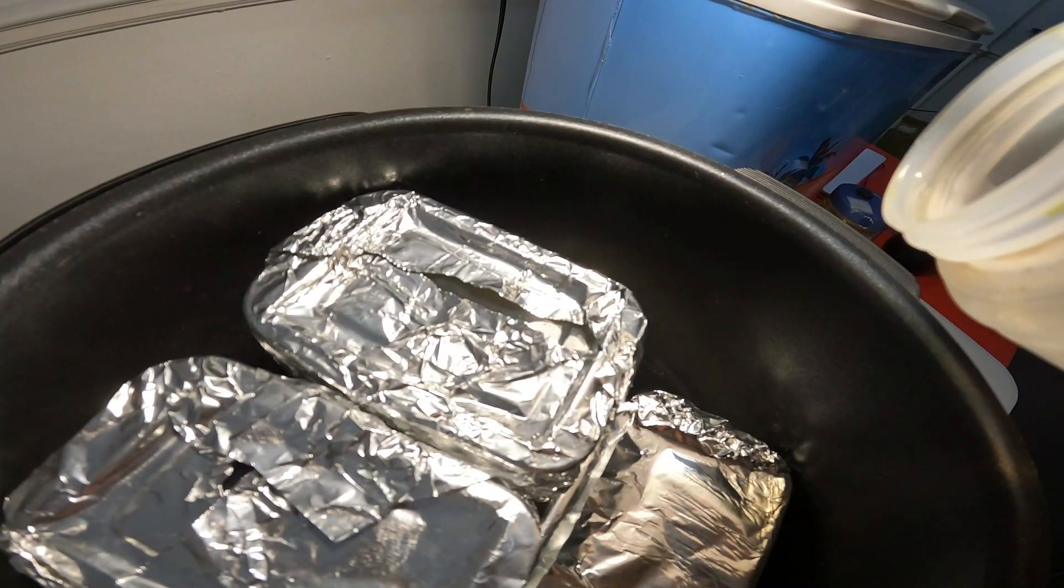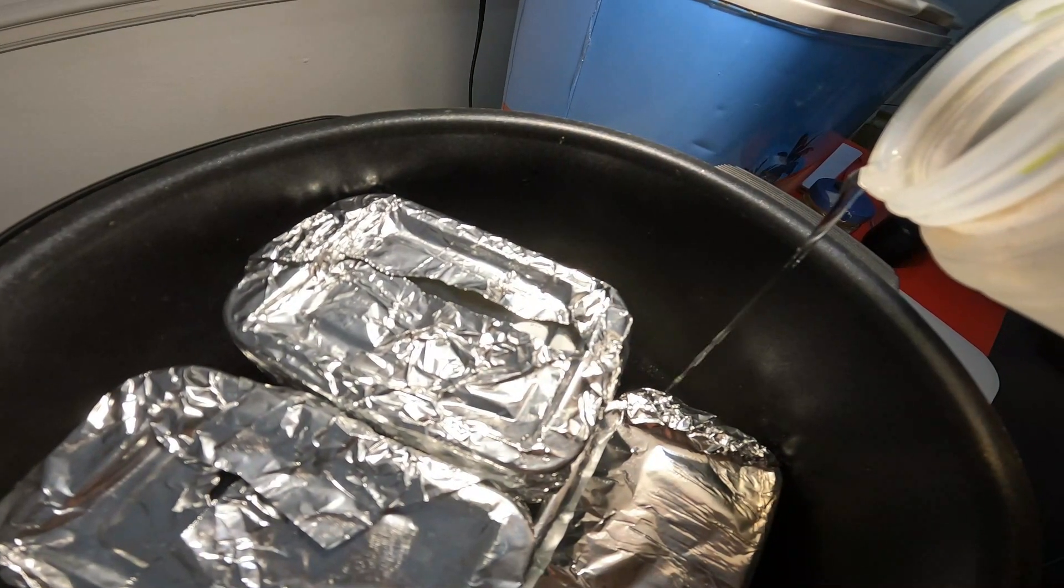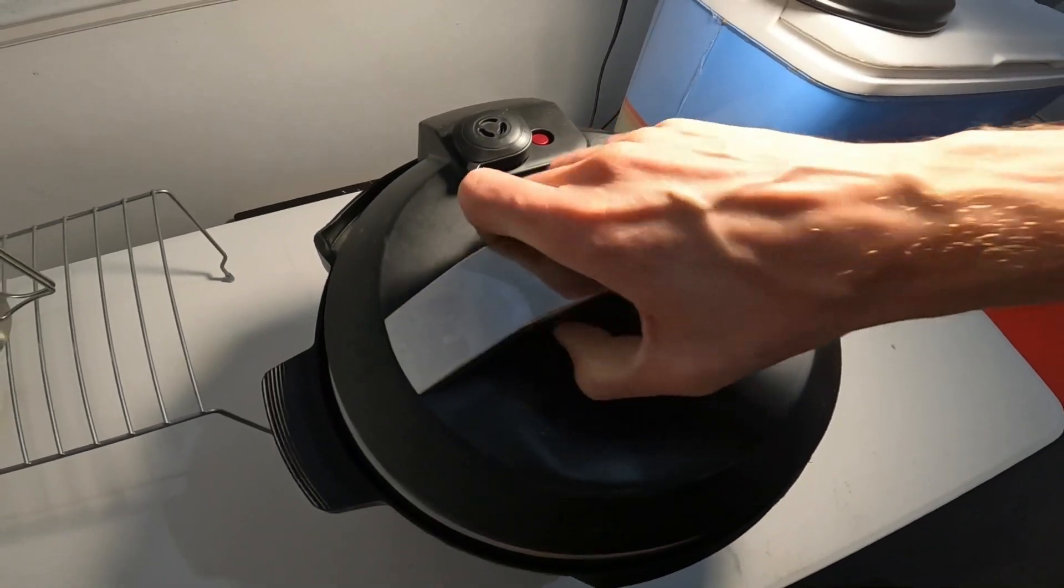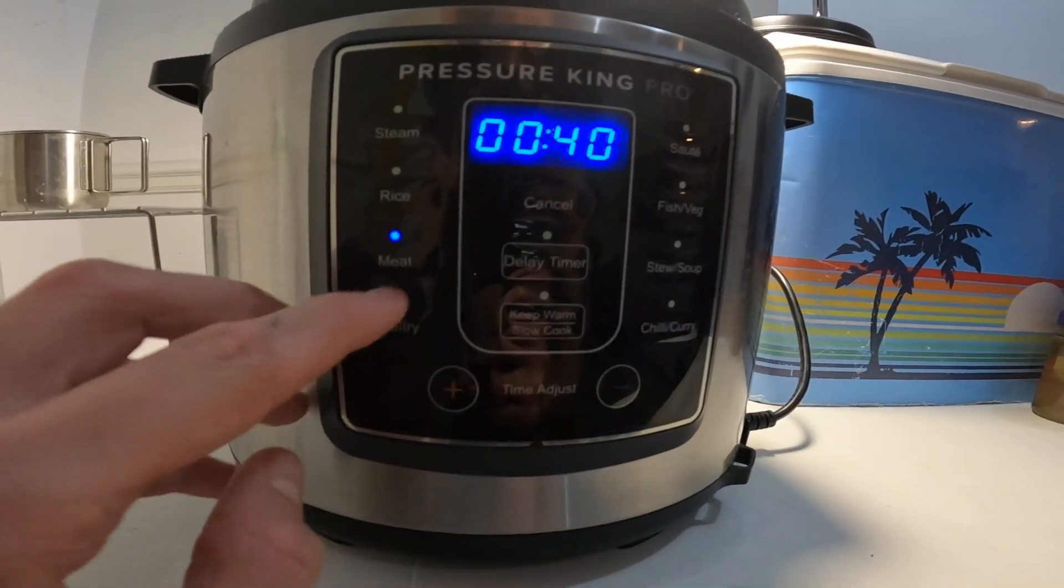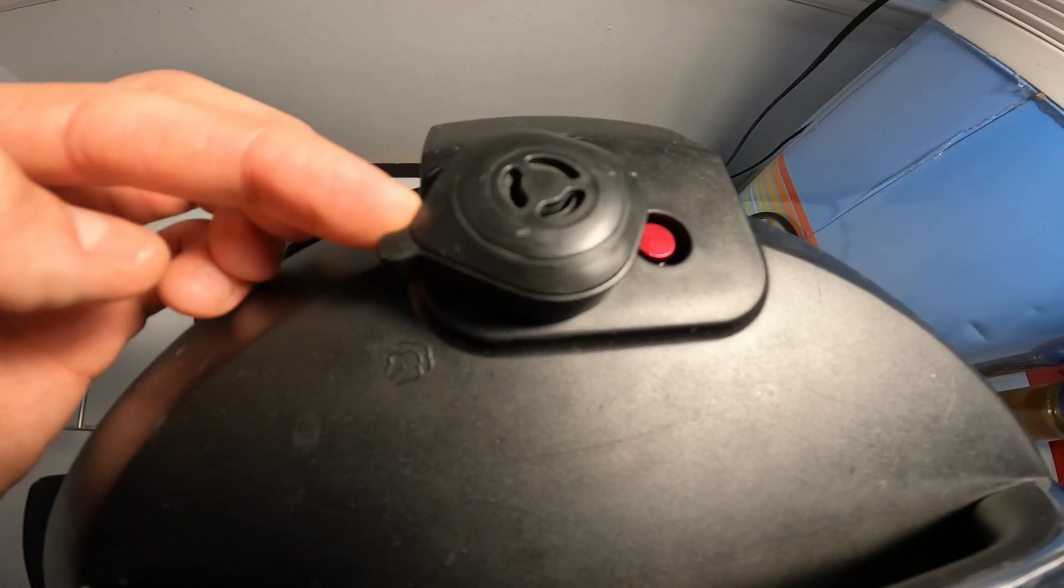Too lazy to walk to the sink, I just filled the pressure cooker with what was left in my water bottle. I secure the lid and I set it to meat for 40 minutes. I leave the valve open until it gets up to temperature.